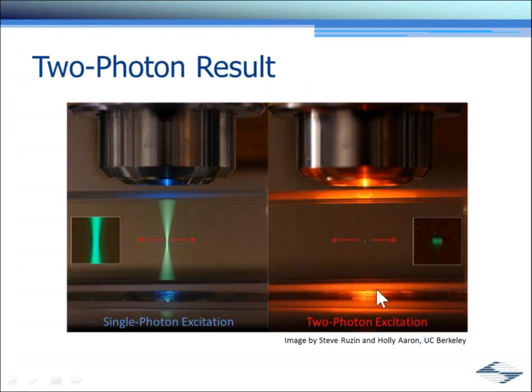Just to make sure we're all on the same page, this is laser scanning microscopy. This focal spot is essentially scanned back and forth. As we scan back and forth line by line, we can raster scan a frame through our sample, through the volume of our sample. And of course, most of the imaging that people are using laser scanning imaging for is to look at three-dimensional structures and recreate our three-dimensional image. So we can then scan that field through the volume.